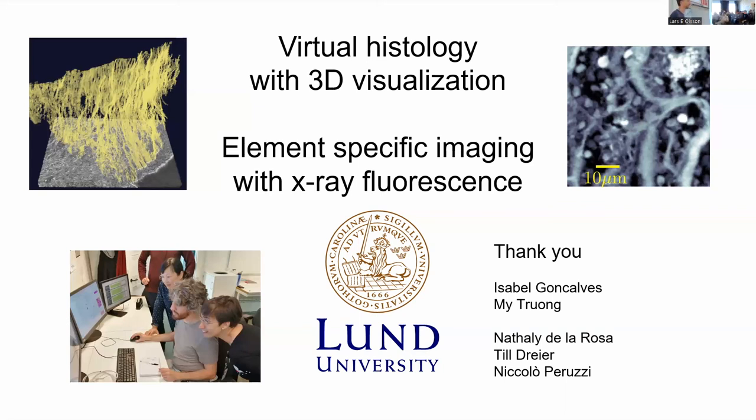One of the scans that we do takes maybe 2 to 3 minutes at the moment. With a micro-CT, you could get close to that in some setups, but it will take overnight. That's amazing. Wow.